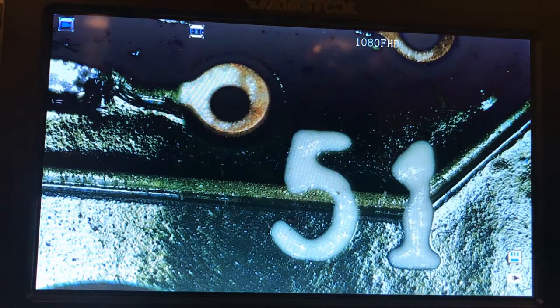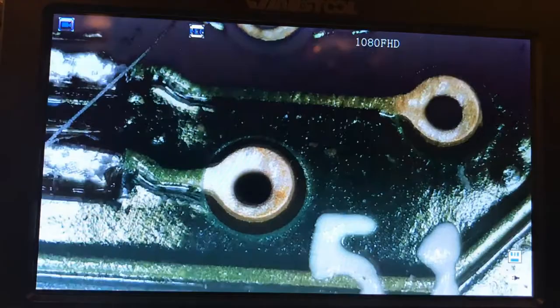I thought I would show you some of the things that I really like about this thing. I've been using it for a little while. It's a little hard to tell on your screen, but the magnification is fantastic. There's some corrosion on here that I can't even see with the naked eye, but I can clearly see on this thing. I saw a review where somebody did a scientific test and they do claim 1200x magnification. The reality is you're getting probably closer to about 100x, which is basically all you practically need.